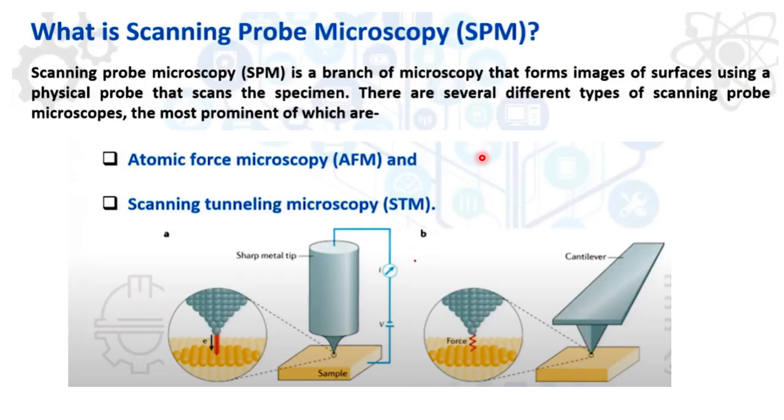In a similar way, we can do the same thing at the atomic level. That is the probing. When the stick is touching the ground, that is called probing. Similarly, here a very sharp metal tip is used, and it is probing your sample surface, getting a signal from the sample surface.